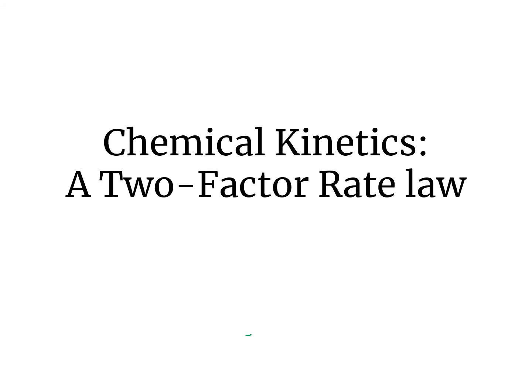Hello again. So in this week's experiments, we are going to talk about the rates of reactions and the two-factor rate law. You notice that in this experiment, we are going to examine rate law and the order of a reaction that involves two reactants. In this, we will be monitoring the concentration of species by observing the color changes over the course of the reaction, and it should help us understand other concepts like half-life of a chemical reaction.